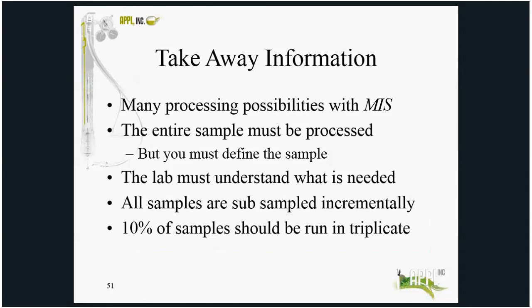Well, your takeaway information: I hope you understand now that there are many, many ways to use MIS in the laboratory. And just be sure whatever course you take, the lab processes the entire sample, that the lab understands what your needs are, and that the lab follows through with incrementally sampling and doing so properly during the laboratory process, that your triplicates are performed at frequencies needed to meet your DQOs.